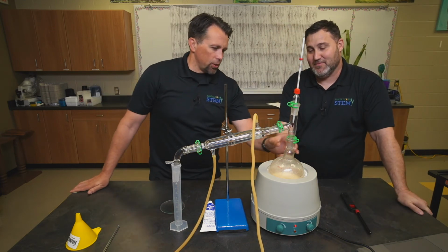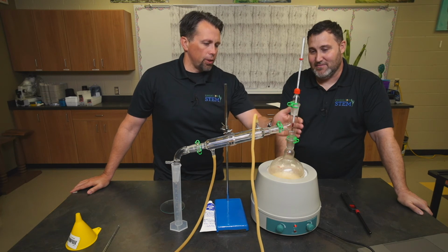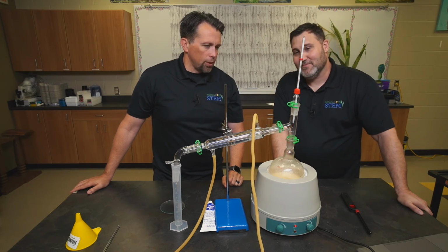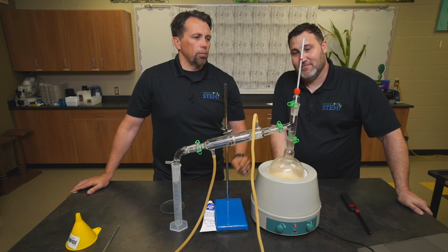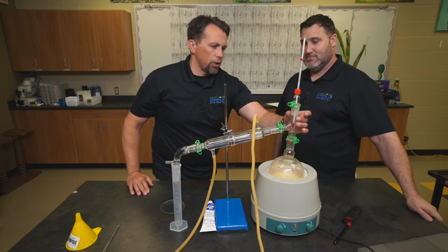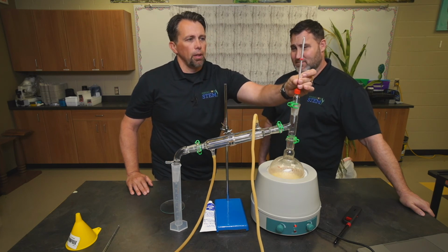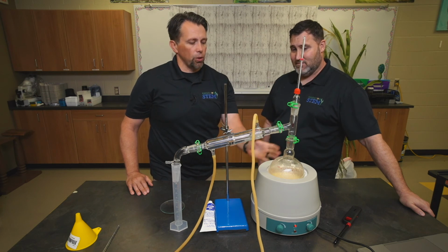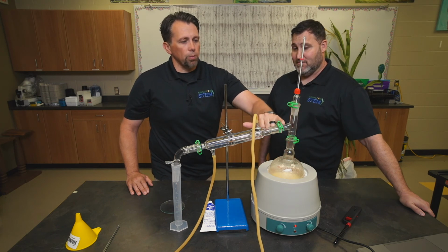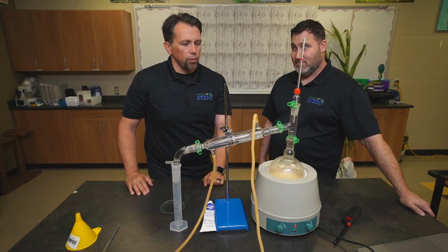So we've let this run for a few minutes, and you can start seeing some droplets condensing on the flask here. That will reflux or drip back down. Eventually, these droplets will move up as the distillation progresses and gets warmer. You want to keep an eye on your thermometer because it's going to start going up relatively fast. About 10 minutes in, we're starting to see quite a bit of reflux up in this area. Our temperature has gone up to about 45 degrees Celsius. Once the temperature starts going up on the thermometer, it goes up relatively fast. That means you're getting some pretty good boiling going on down in the distillation flask and the vapors condensing up in here. You'll start to see some droplets form in here. We've got a few droplets forming right here, and we'll start seeing it dripping over relatively quickly.